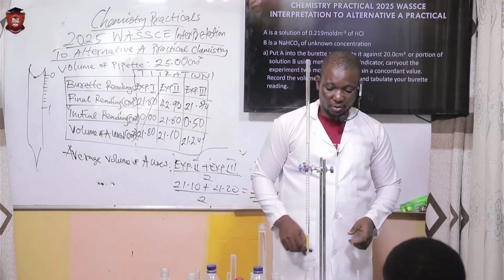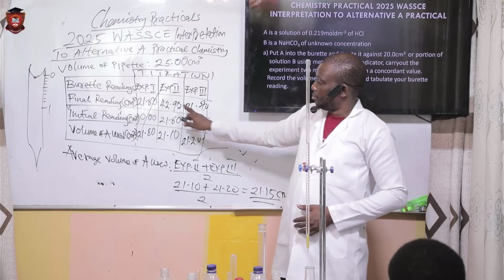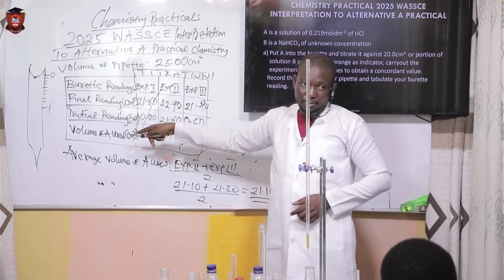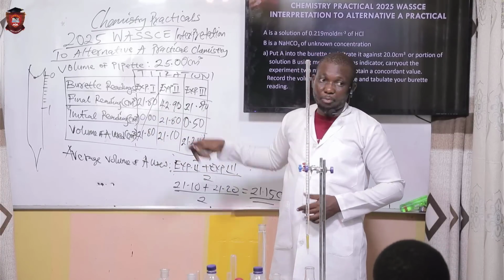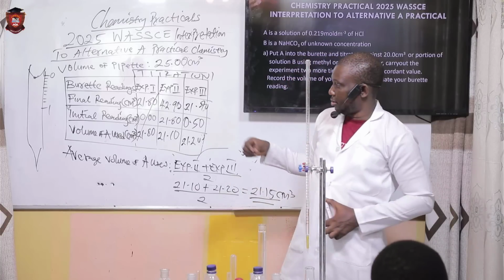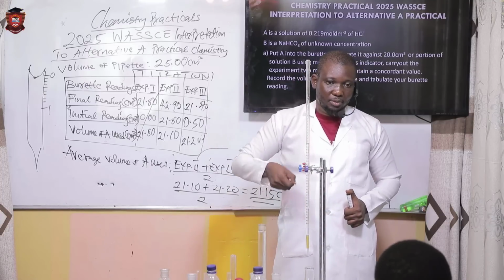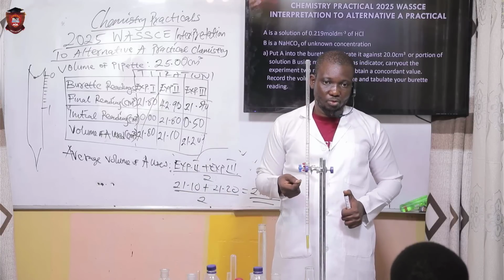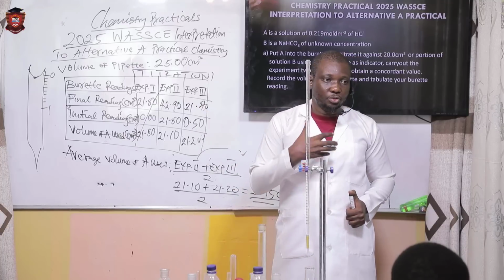Check if it's correct. And again, I will just say two things here now. This table, both initial and final, you can see they are in 2 decimal places. You see there are units here. And please, no form of mutilation. You're going to be penalized if you mutilate, or if after recording and writing the table with pencil you now encrust it with Bic. They also penalize you.